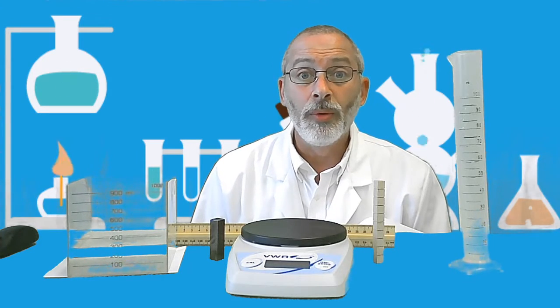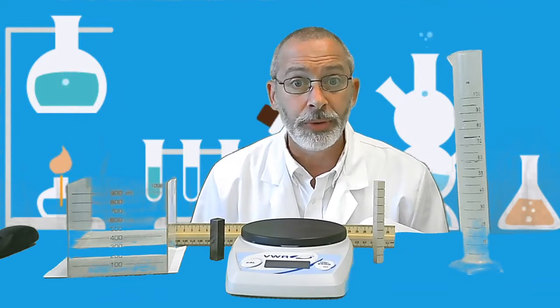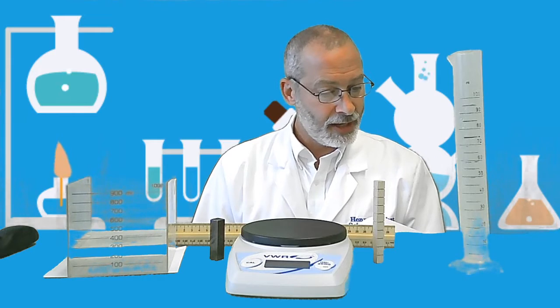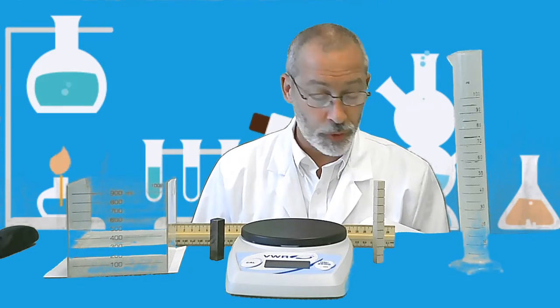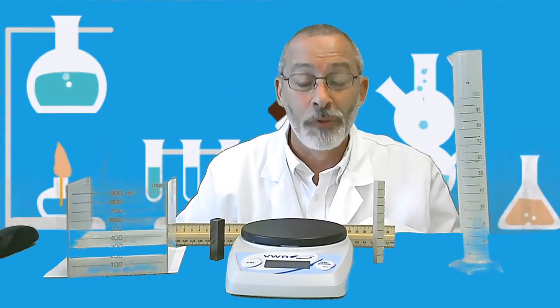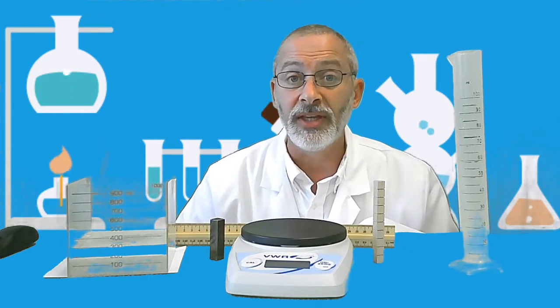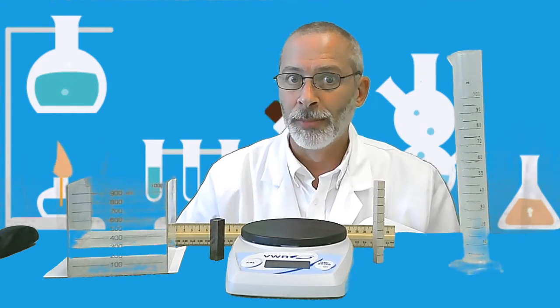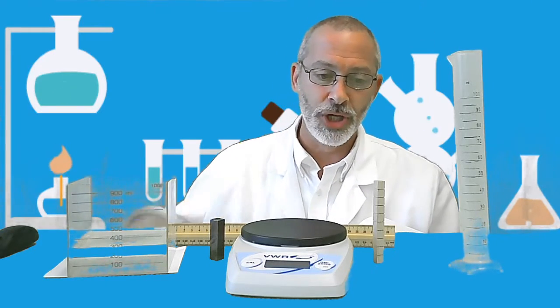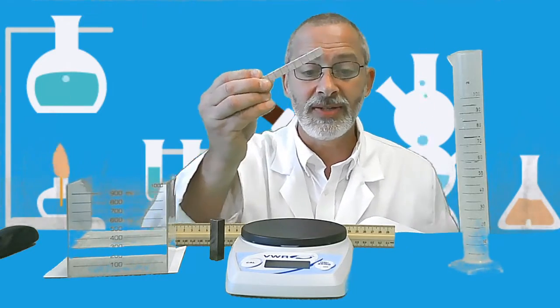All right, now we're going to follow these procedures and I will perform them for you so that you can write down your observations. The next step says, in the procedures we are, obtain materials and set them up. Well, I've got that all done for you. Step 2, determine the mass of object A by using the balance. Remember, we use a balance to determine the mass of an object. Well, here is object A. Object A is a wood block.